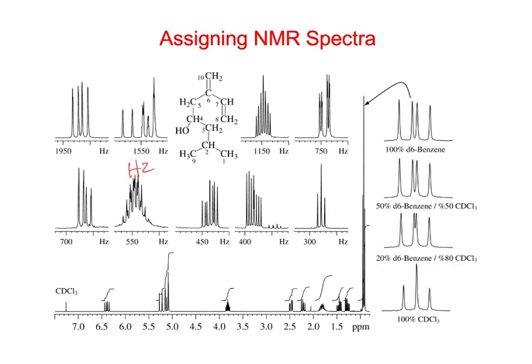Right? And if we look at that proton, this H7, and we have these 2 H8 protons, we should see two different couplings here as well. We have this kind of cis coupling here, and we have this trans coupling over here.